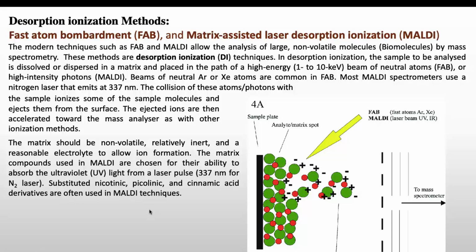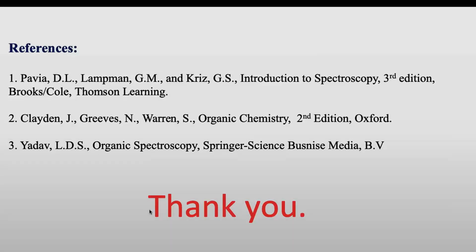So these were the different methods for ionization we use in mass spectrometry, which is the second component of the mass spectrometry technique. And thank you very much.